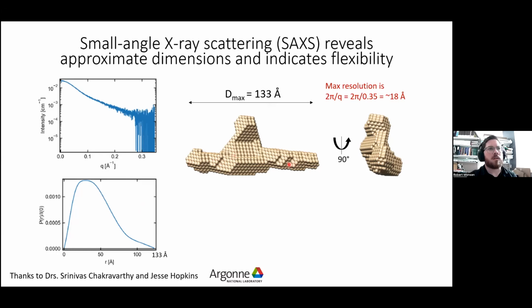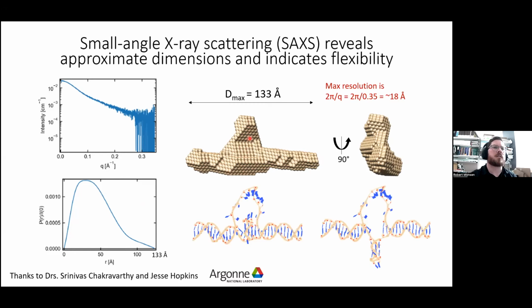And that's shown here. What you can see pretty readily is that there is what looks to be a duplex axis across the bottom here. And then there's a central density that protrudes only in one direction, but it's not a cruciform. So this is our first indication that what we're getting is not quadruplex and reverse complement sticking opposite of each other, but instead it's more consistent with the quadruplex sitting in between the two duplex arms with the poly dT doing something.